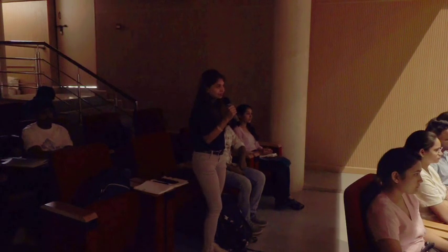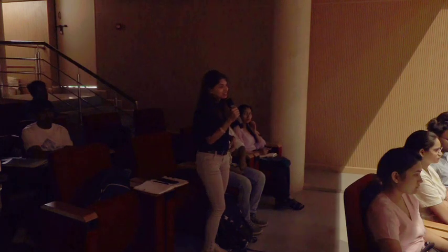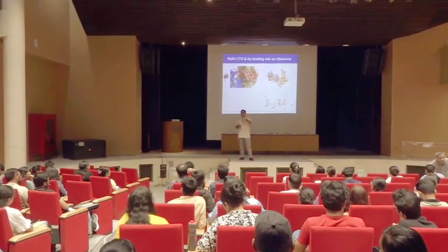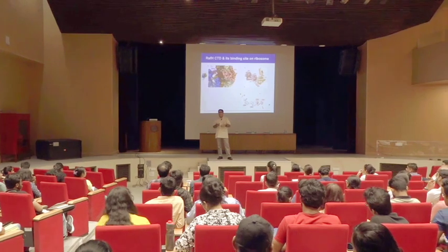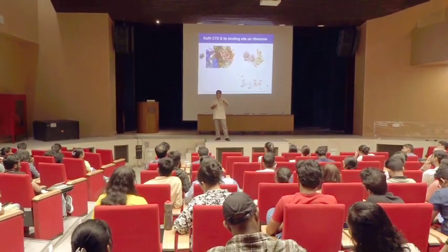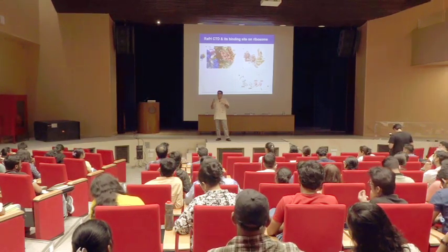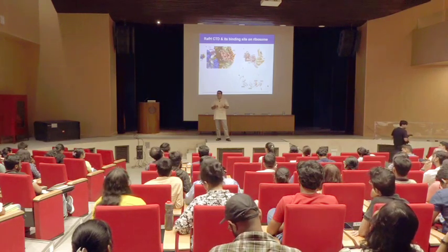One way is you collect lots of data, and I know that in India it's not that easy to get a lot of data, and then keep doing classification. That is one way. Another way is to find some buffer or some component that stabilizes. In the literature, see how other people have done it with myosin.